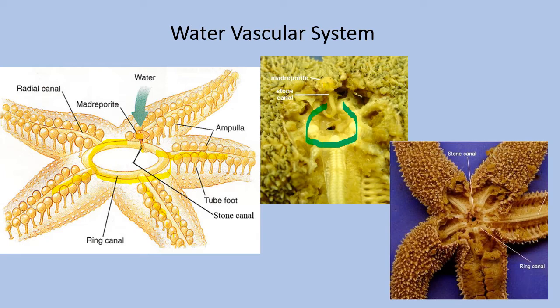What you would actually see on the surface, though, and if you felt it, would be hard, kind of bone-like plates. So it feels very firm there. So there are these mineralized structures that kind of operate like bone. But inside of those plates would be the actual ring canal. The ring canal itself would be soft and vulnerable to damage, just like the stone canal. But it's protected by those bone-like plates.